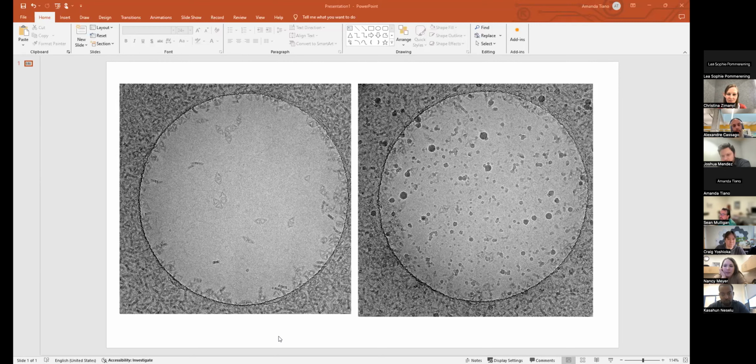Yeah, thanks for bringing that up, because I wanted to mention with the other one that the carbon wasn't saturated. You can do multiple additions of sample to try and force things into the hole so that you oversaturate the carbon, and that can help.